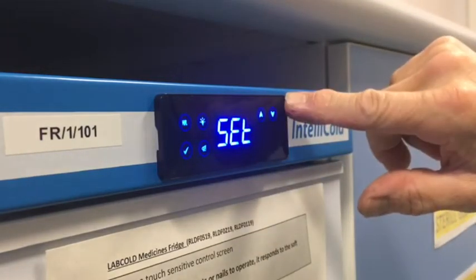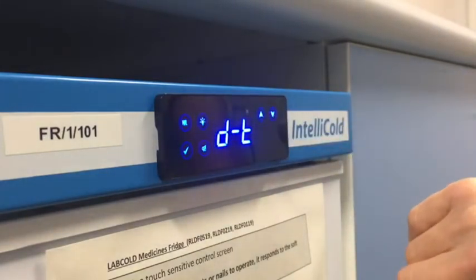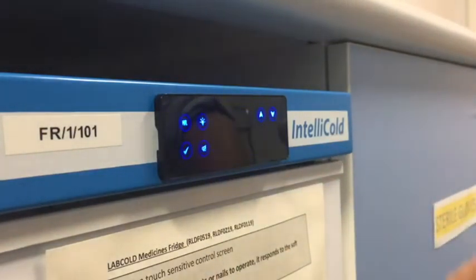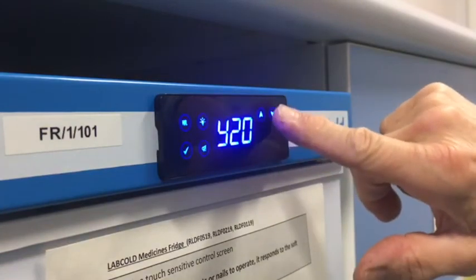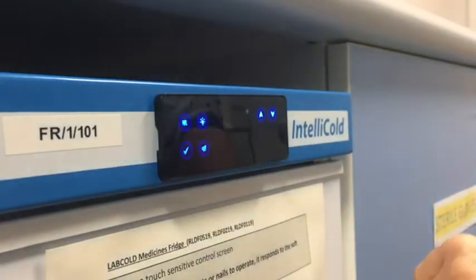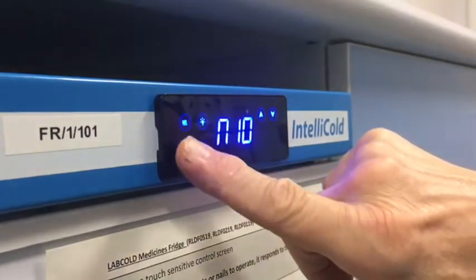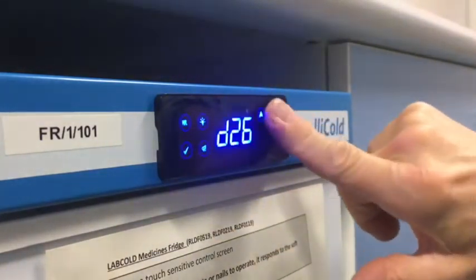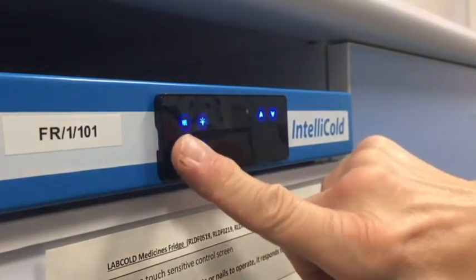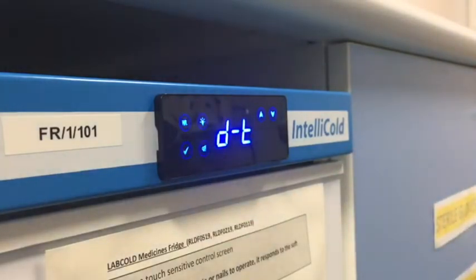Move through the functions by touching the up or down arrows until you see DT, which stands for date time. Touch the tick and the display will go into year. If it needs adjusting use the up and down arrows, or leave it if it's correct. Touch the tick again to move to month, which has an N prefix. Change or move forward to date by touching the tick, and so on through hour and minute, adjusting as necessary. Finally touch and hold the tick to store the new date and time.